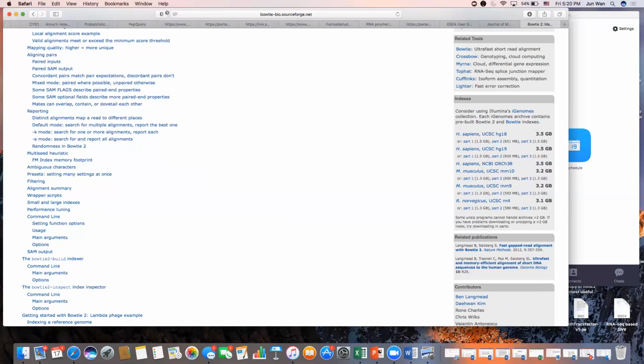So you can download these directly. I highly recommend that. They're already done for you. Or you can do it yourself. Now I'll tell you the outcome when you build your own. You get 6 files, just like those. So you can get those 6 or you can make your 6. However you want to do it, it's up to you. BT2 builds 6 files. These have 6 files. It's up to you. Whatever amount of discovery you want to do, I encourage it. Just be aware that there may be wall time issues. If you want to get around those, just take the indexes that are already prepared for you.